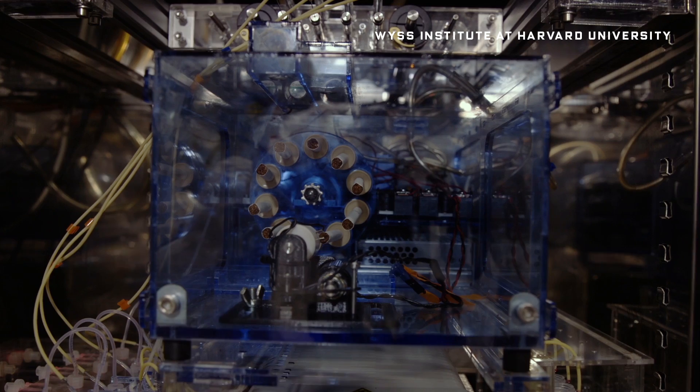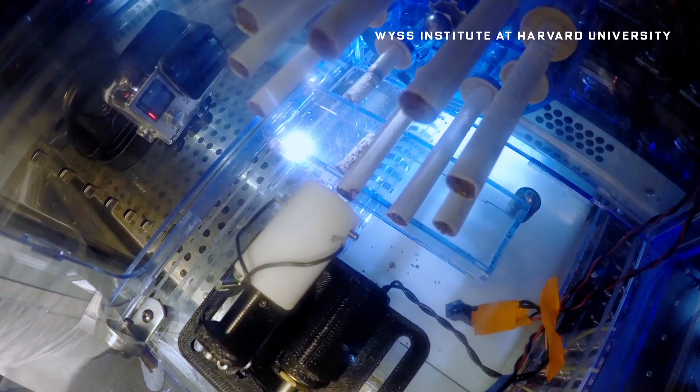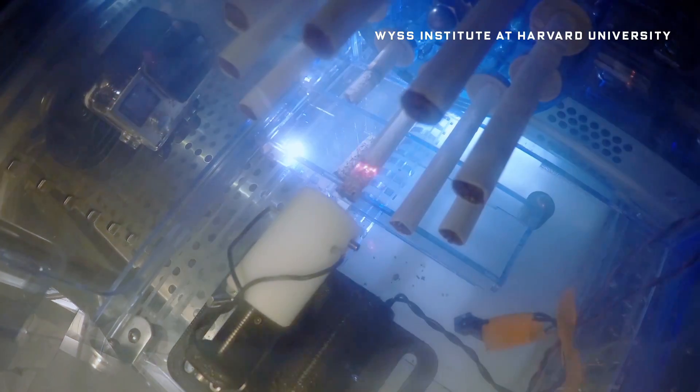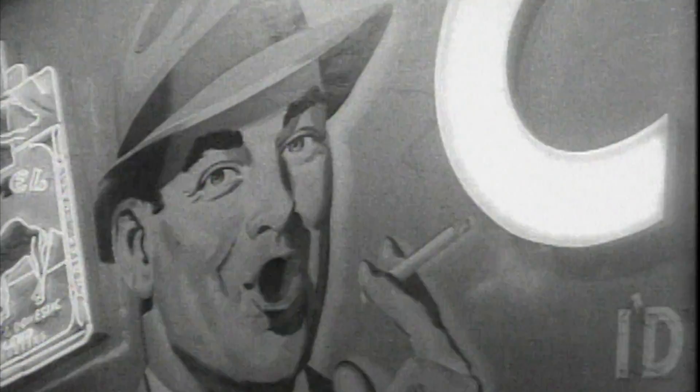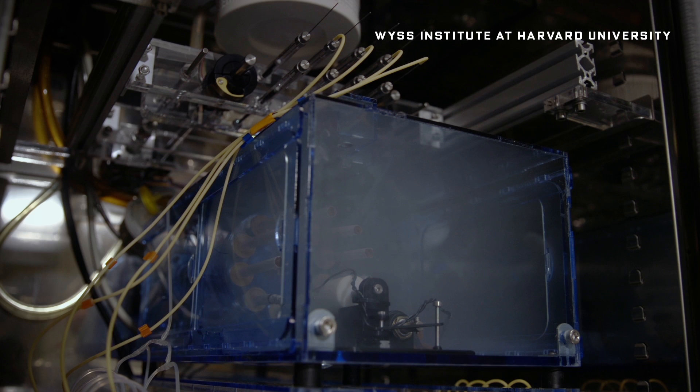Here's something: a chain-smoking robot. We've got a regular Marlboro man over here. Now to be clear, human smoking isn't as cool as tobacco companies would have you believe, but a smoking robot is totally cool.